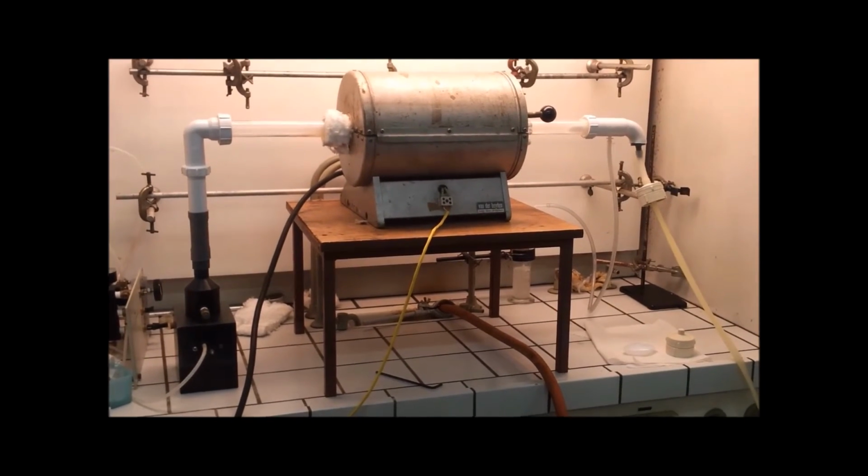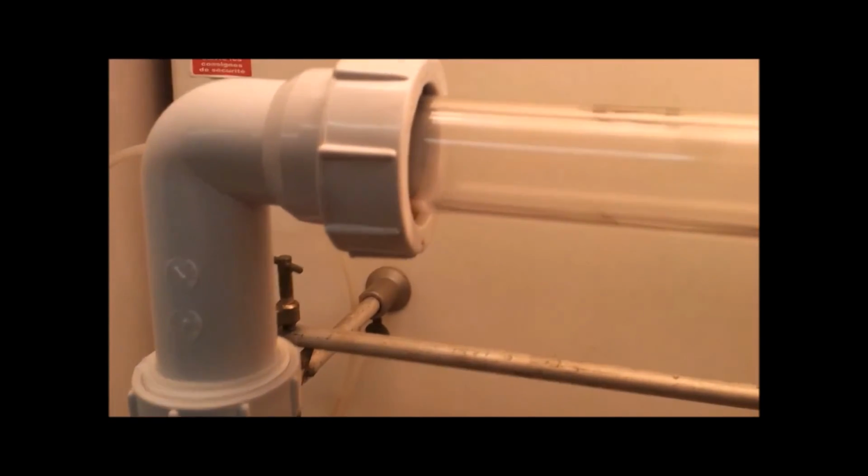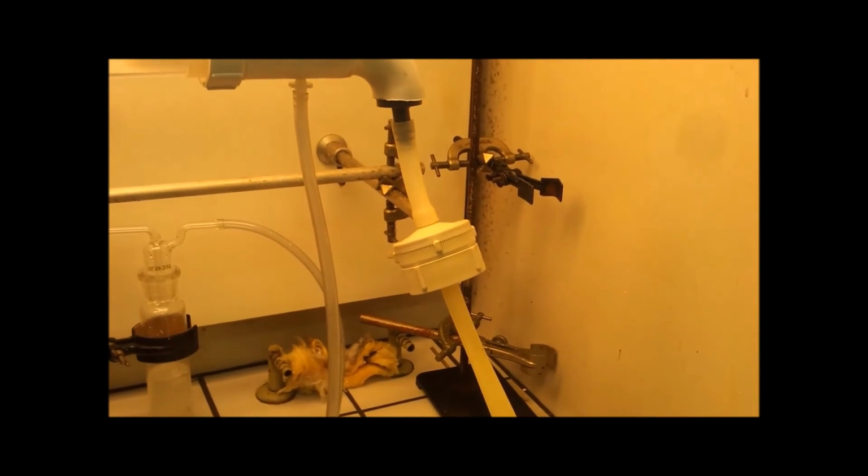This is the rather modest, I would say, setup that we have in our lab. On the left-hand side, you have the generation of the aerosol that you can actually see flowing through the glass tube there and proceeding through the tubular furnace here. On the other side, we collect the dry particles on the absolute filter, and there is of course a pump to force the flow.